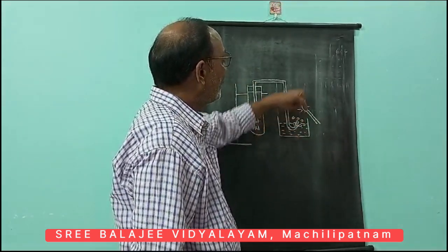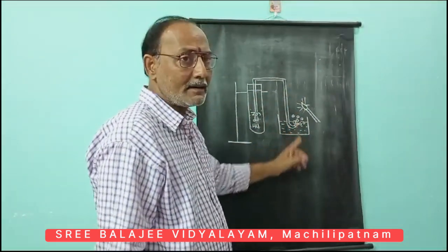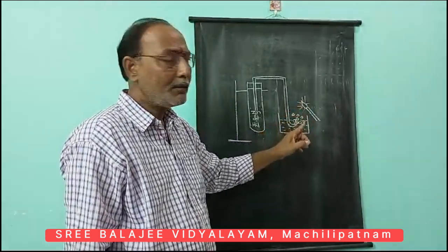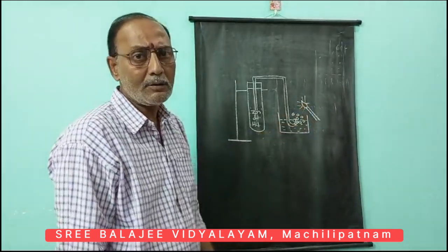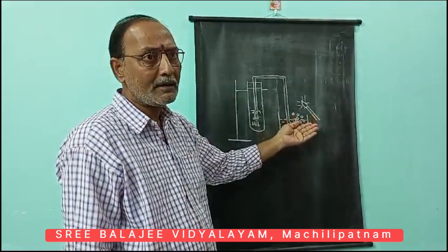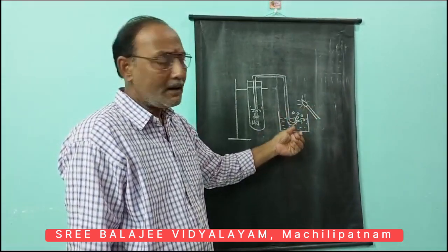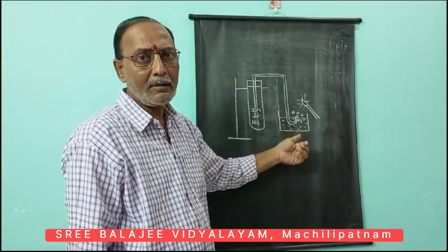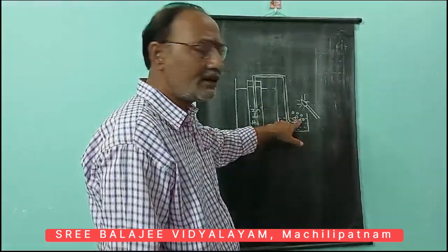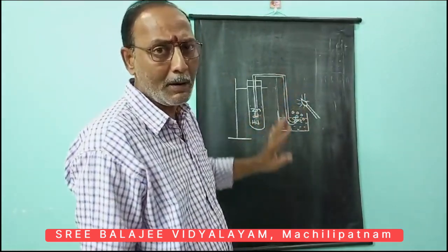and when you keep this burning candle very close to this hydrogen gas, the observation you notice is that the yellow color of the burning candle flame turns into blue in color, and not only that, after some time you can hear a pop sound produced here. So this indicates that the liberated gas is hydrogen. Why? Because the sure test for the identification of hydrogen gas is the turning of the yellow flame into blue in color and making the pop sound.